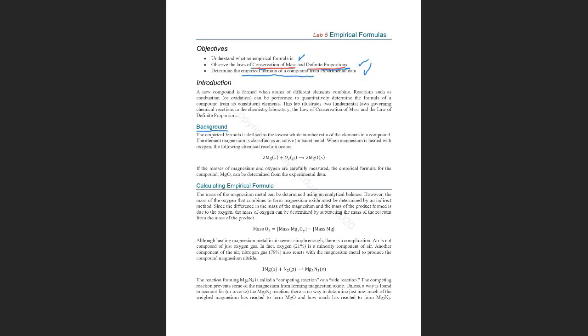Let's say you have a beaker with a solution of aqueous silver nitrate, just to give an example. Next to it, you have a graduated cylinder filled with potassium chromate.